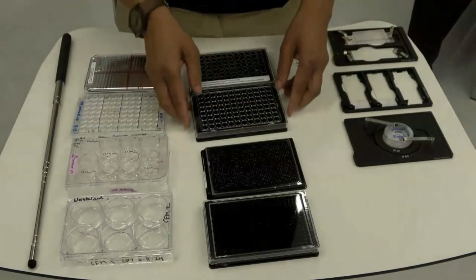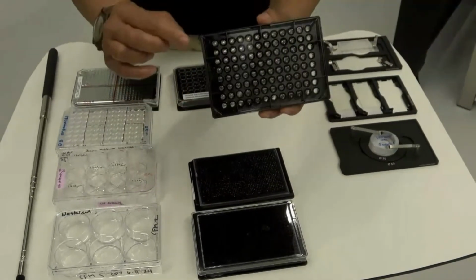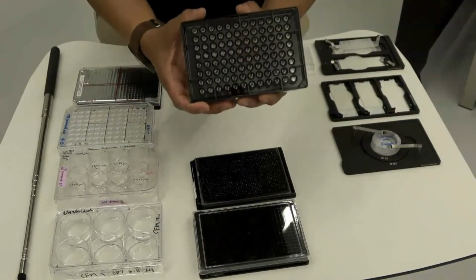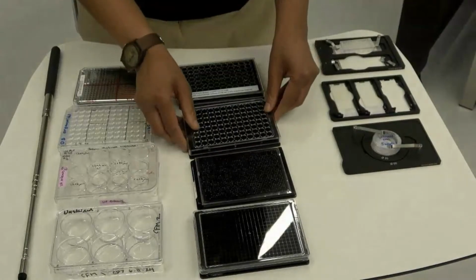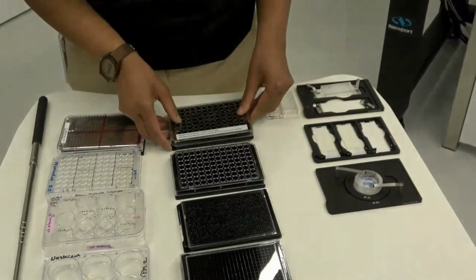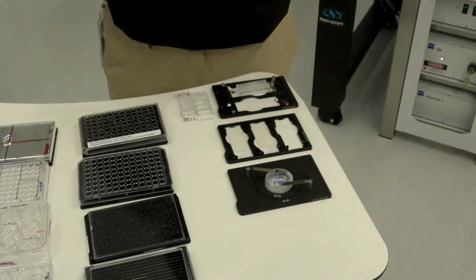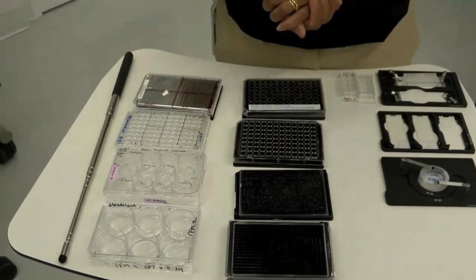These are some of the 96 well plates that I utilize regularly, but I just wanted to point out very quickly the skirt height. The skirt height is really low on this one, around 150 microns, and this helps the CD7 to image all of the wells in this plate, and it has an automatic display visually for you to see how far it can image on a well plate. I'll show you that in a minute. This plate has a higher skirt height, as you can see, so I just wanted to point that out. Very quickly, the CD7 can also image slides, multi-chamber, and 35mm dishes, but we might cover this on a separate YouTube channel. But for today, we're just going to image with multi-well and multi-chamber plates.